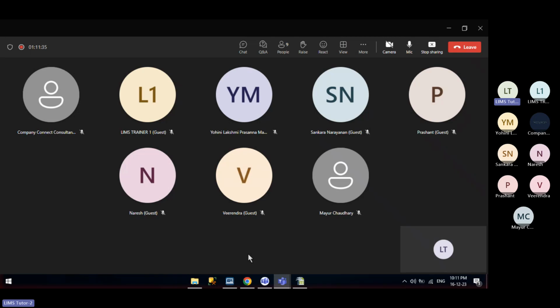In my current two organizations, we have tried to automate the master data and static data creation process from the organizations' specifications, to see how the data can be transferred directly, but no. Static data is the heart of a LIMS application.